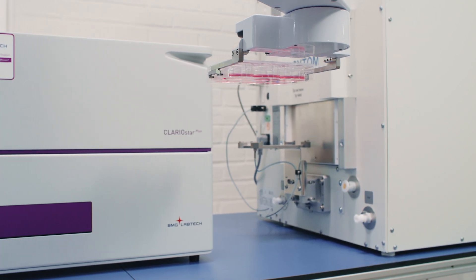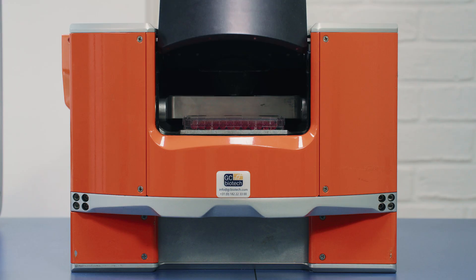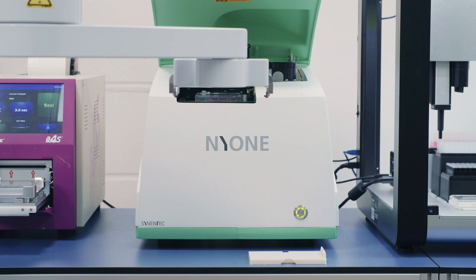One of the main strengths of our system is that it can accommodate so many different types of instruments. For example, the system behind me has a centrifuge for the 96-well and an imager for the 6-well.